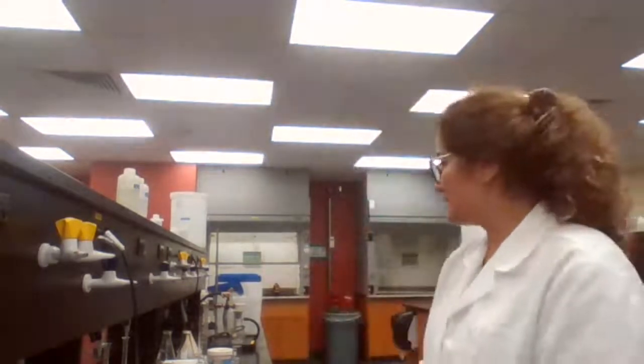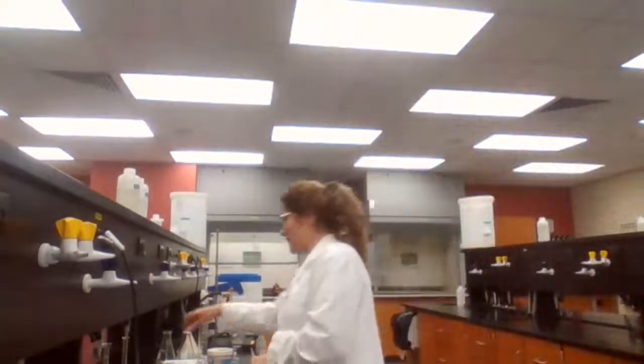How would you seed crystals? There are a few tricks to that. One, you can add a piece, a few crystals or a few grains of the pure sample. That's the case where you already have pure sample in the lab. You add it into your solution, and because it's supersaturated, it's going to crystallize right away, and every particle of the sample is going to come down in the solid form.